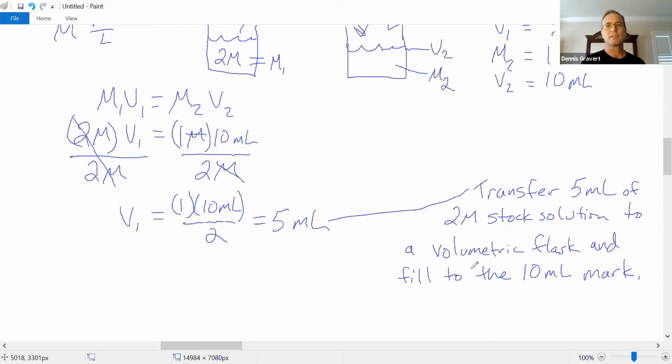Well, it turns out that when you mix different solutions together, sometimes they can exotherm, they can heat up, sometimes they can cool off, and that'll expand or contract the volume. And sometimes there's no energy change, but the molecules, either by dilution or by mixing with the solvent, if you have different solvents, there can be some chemistry underlying there that can change the volume. So volumes aren't necessarily additive, they're kind of weird.